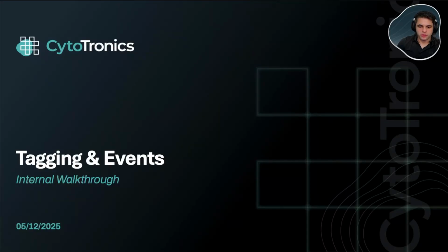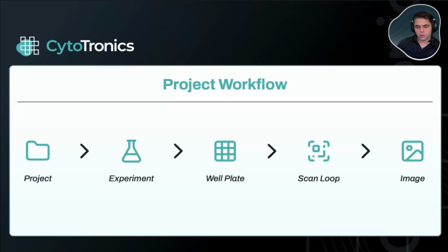Before we dive into new features, let's take a quick step back and revisit how the project workflow is structured and why tagging is needed. Our workflow follows the hierarchical model. Projects contain experiments, experiments contain well plates, well plates contain scan loops, and each scan loop contains a series of measurements or images. Most of these layers are easy to conceptualize because they either have a name or a meaningful label, but scan loops are a bit more abstract since their unique identifier is just a timestamp with no other differentiating details from one scan loop to the next. That's where tagging comes in.